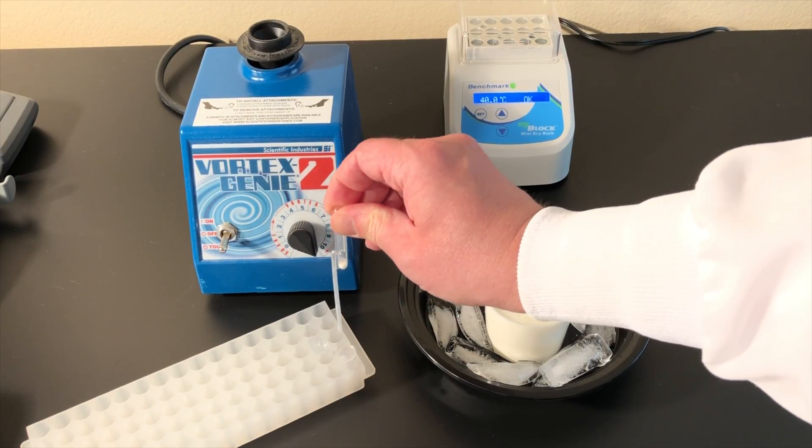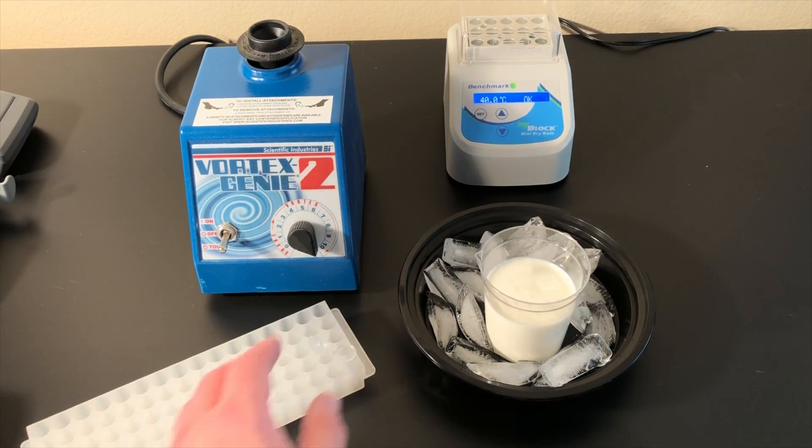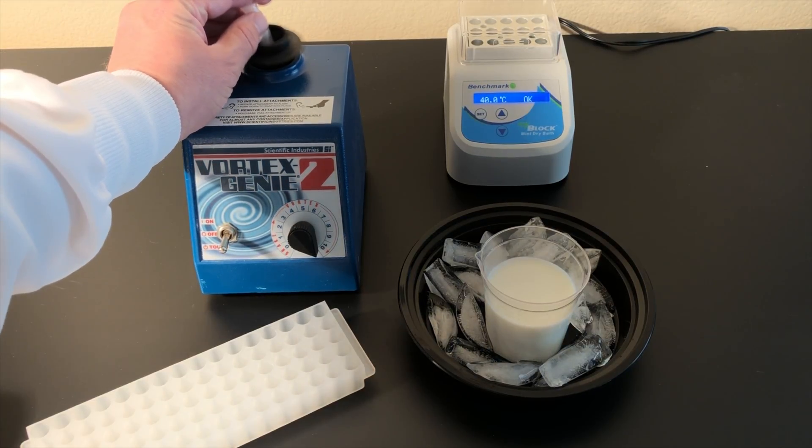Pipet the sample into an AFLA-M1V strip test vial containing conjugate pad. Vortex the vial on high for 5 seconds. Repeat this 3 times.